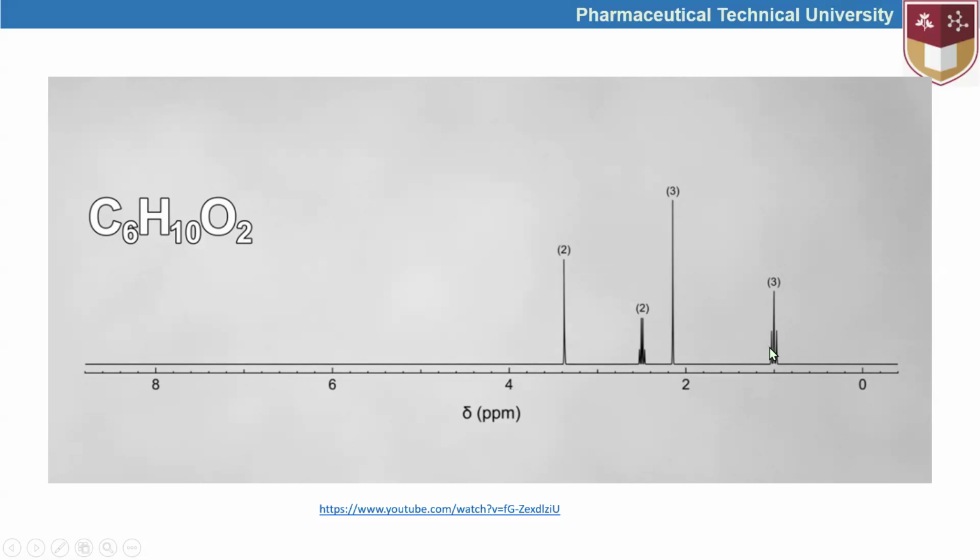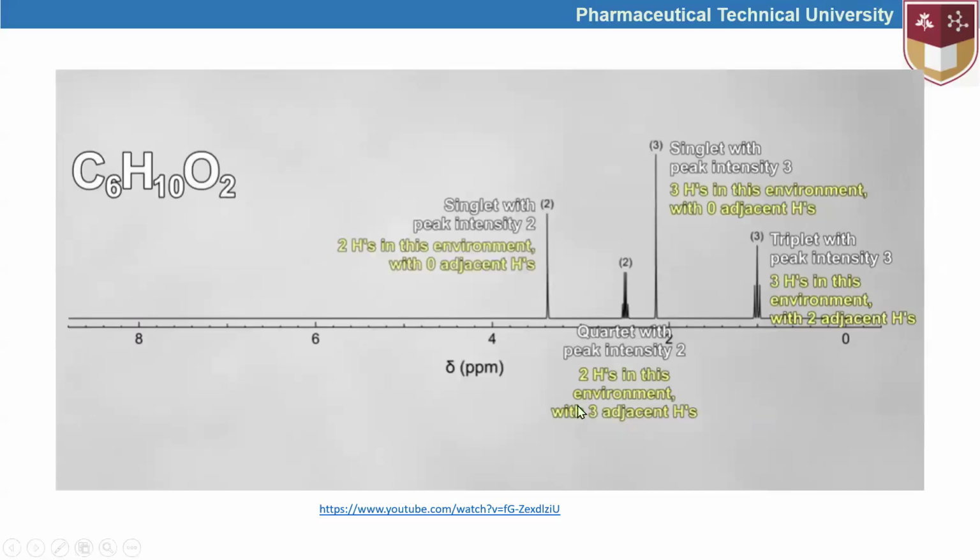And it has one singlet, another singlet, one quartet, and one triplet. So now we are going to understand what they stand for.